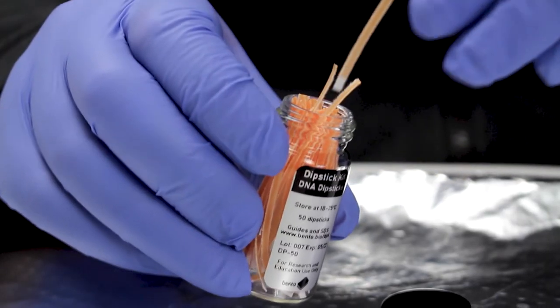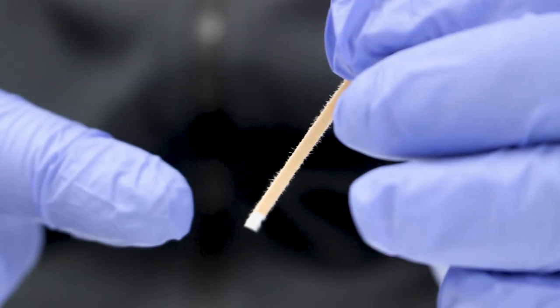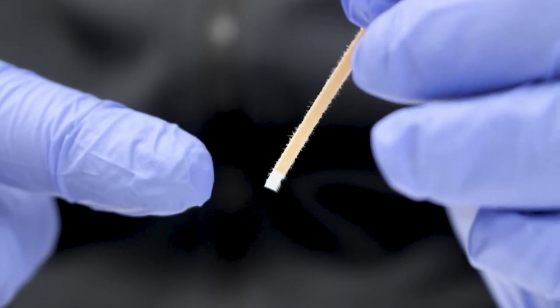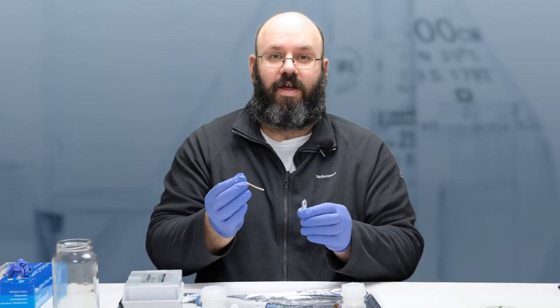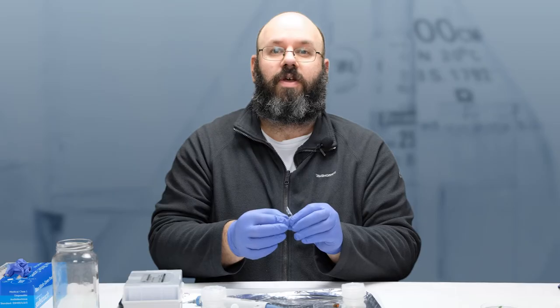The dipstick has a cellulose binding zone at one end. This is where the DNA will bind to the dipstick. Capture the DNA by dipping this end in the extraction buffer three times. You want the binding zone to be completely soaked.